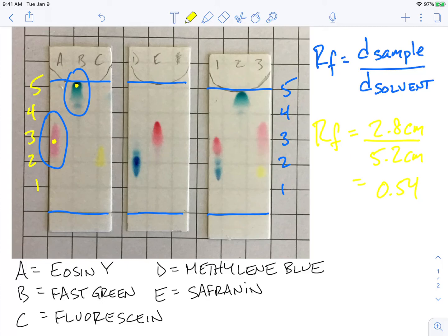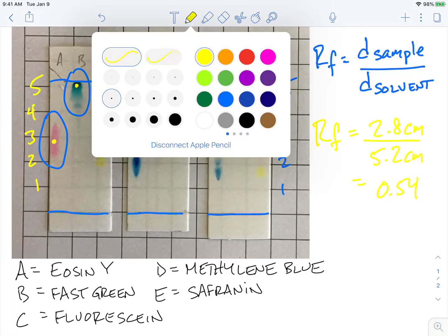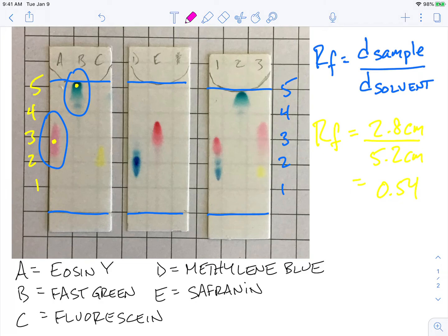And sometimes visually, it can be tricky to tell, like if we were comparing our unknowns to our samples. In this case, it would actually maybe be a little bit easier just to sort of qualitatively compare because our solvent fronts are really close to each other. They're all right around five.